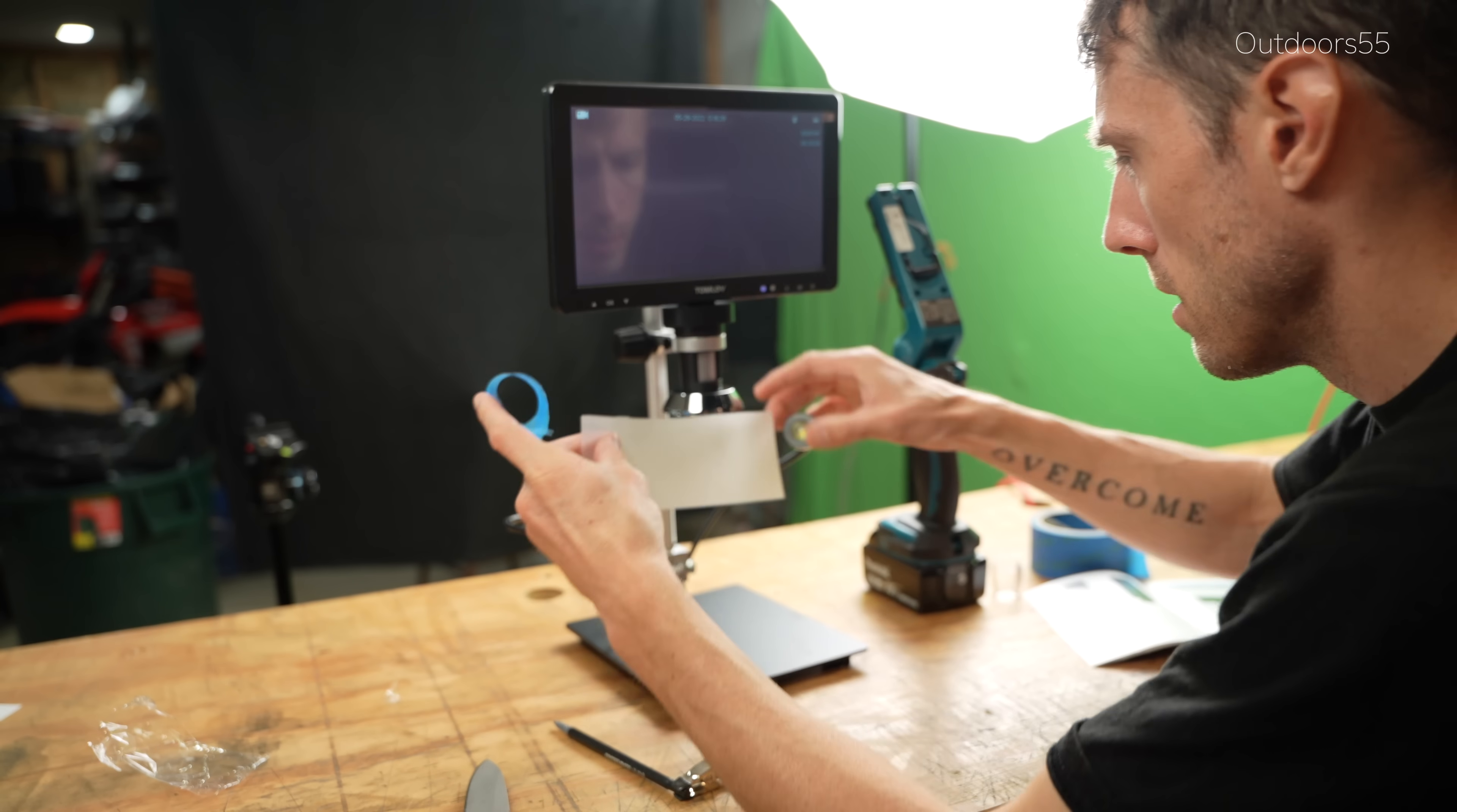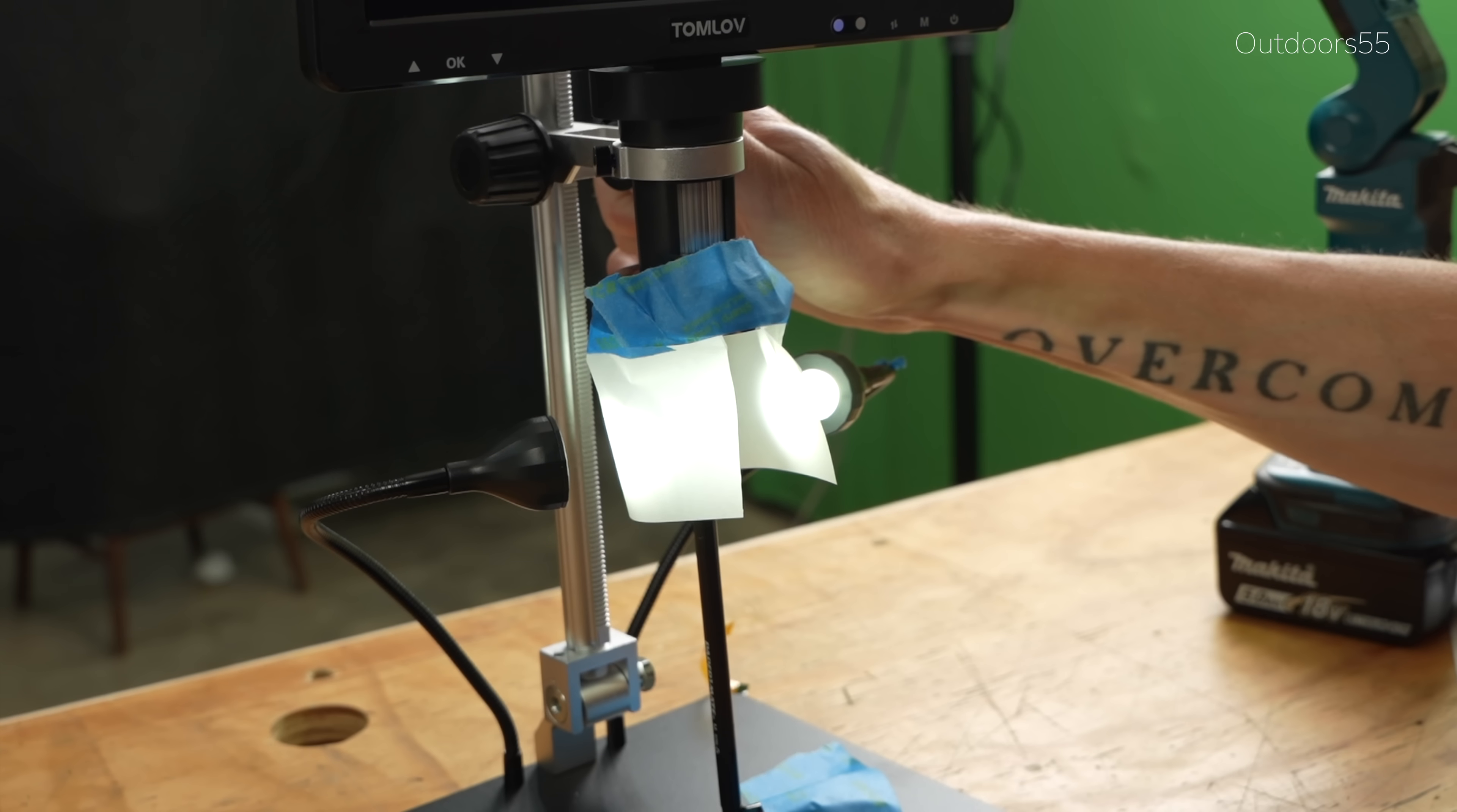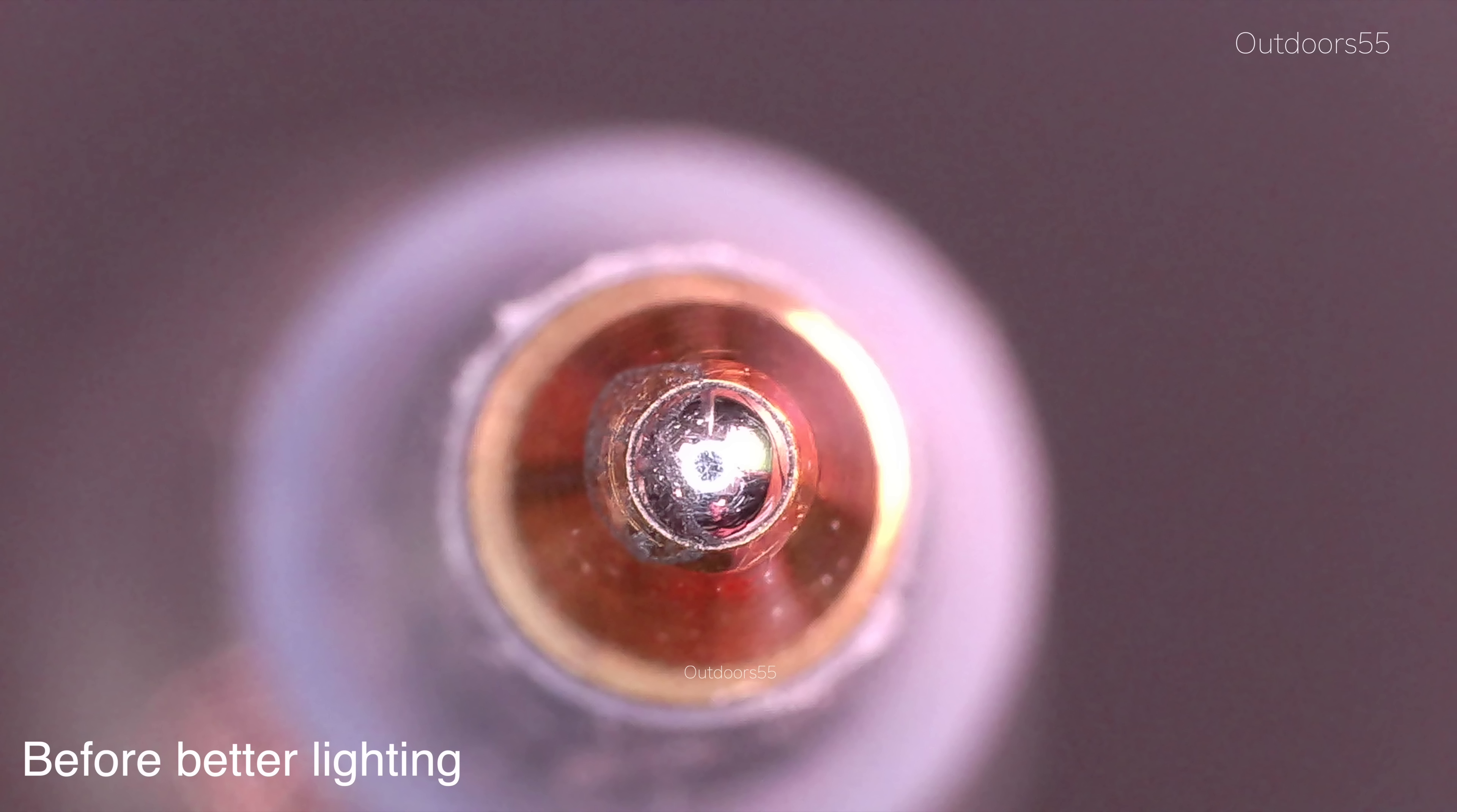However, one thing that we can do is to try to diffuse the light using a piece of tracing paper. I blacked out all of the overhead light using the included hood and relit the pen using diffused light. This gives us a much softer light and reduces the bright and dark spots in the image. So here's some examples of the pen before diffusion. In this image, we have quite a bit of overexposed, blown out areas where we can't see. Next, even if we try to fix this by moving our light source away, because of our limited dynamic range, we end up with areas that are way underexposed and we still have areas of overexposure. But if we diffuse the light source, which essentially makes the source bigger, we can get much more of the object within our exposure range. We still have areas that are overexposed, but this is a much better image than we started with.